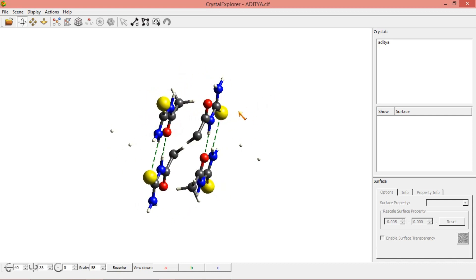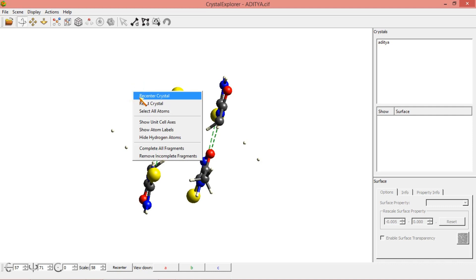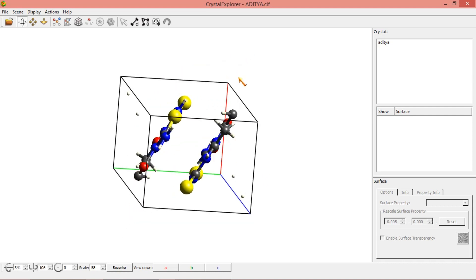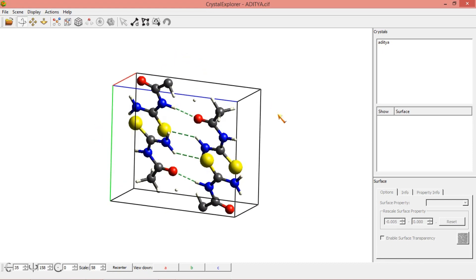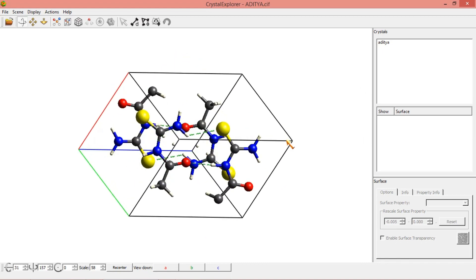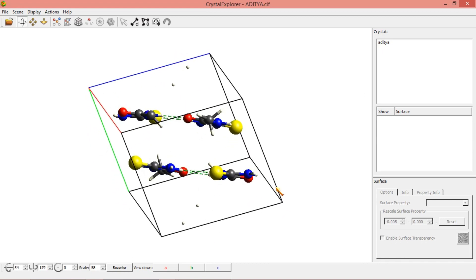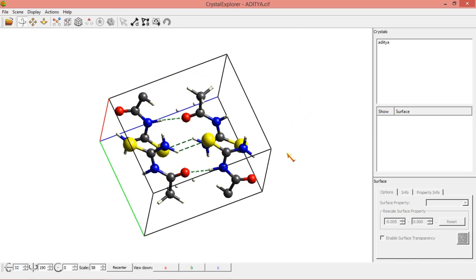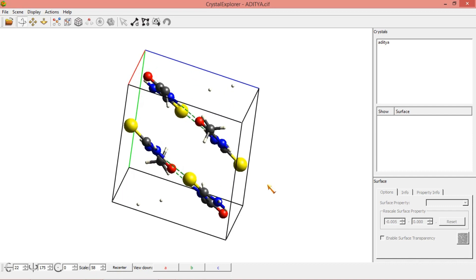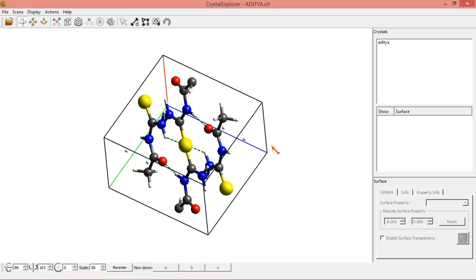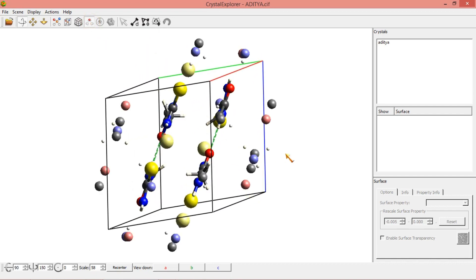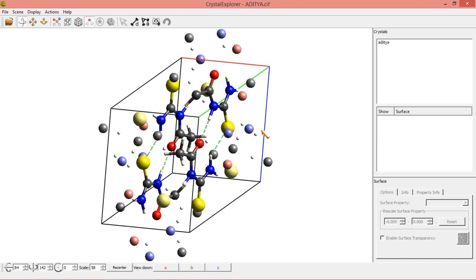I am showing the unit cell axes here. In a unit cell, you can see how many molecules are present in the intramolecular arrangement. If I want to increase this cell, I am clicking again and we can increase this.